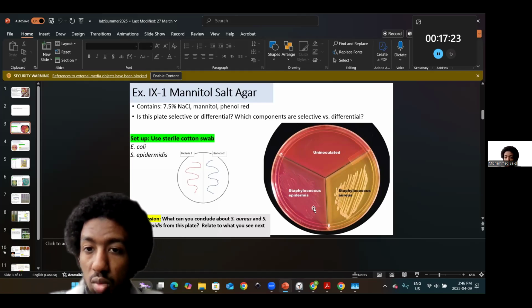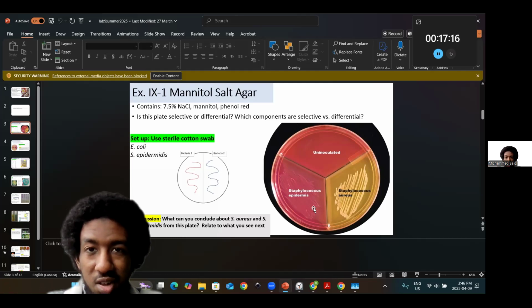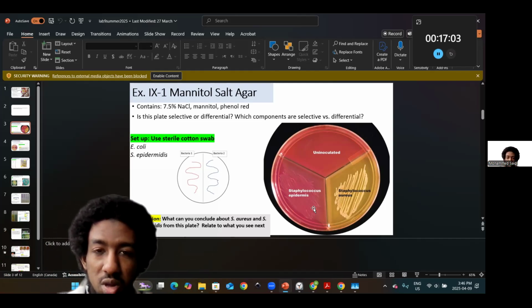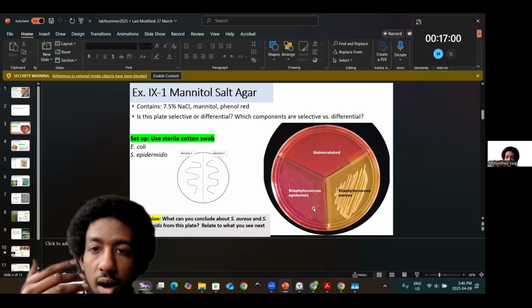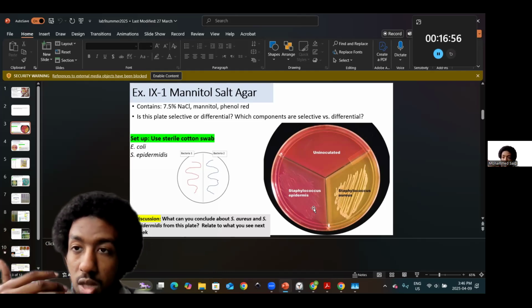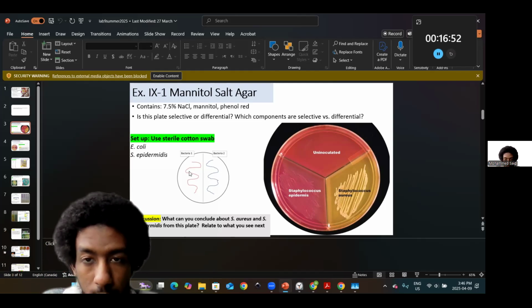You could do this not only with selectable markers like NaCl, you can add in ampicillin with the arabinose operon, right? You could even use a lac operon. You could use discs with ampicillin. I'm just saying this as an example, but there are so many other creative analogies or permutations.